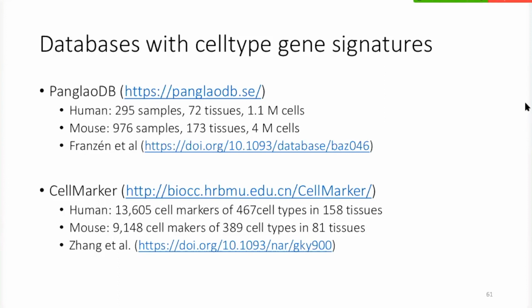Do consider differences between markers. If you have a human sample from the same tissue, and then there is another paper that did exactly the same tissue from mouse, be a bit careful when you look at markers, because markers are preserved, but some of them are not.